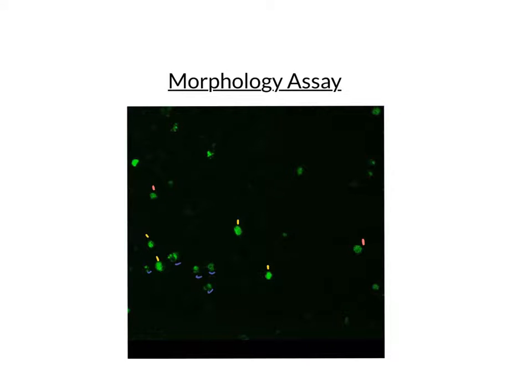The picture is a great representation of the apoptosis cycle of the cells. Also, it can be concluded that the mistletoe extract is a great inducer of apoptosis in HL60 cells.